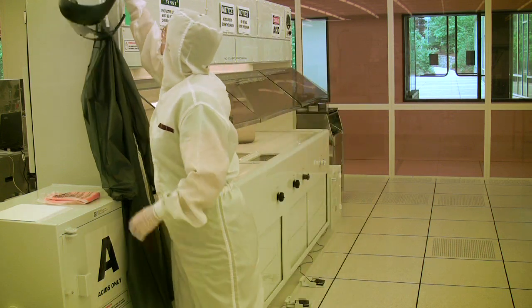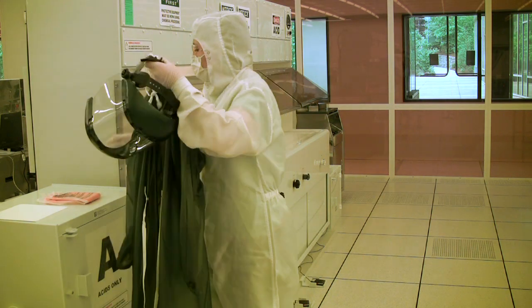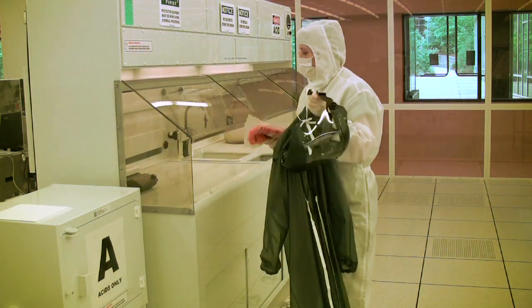Welcome to Fume Hood Training. Before we go over the appropriate methods for handling chemicals in the clean room, let's briefly discuss the fume hood, its various parts, and how it operates.